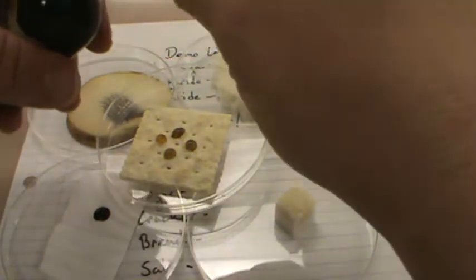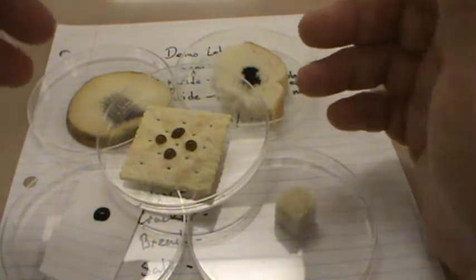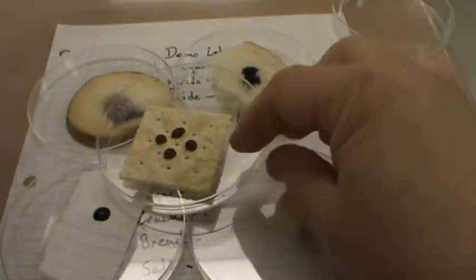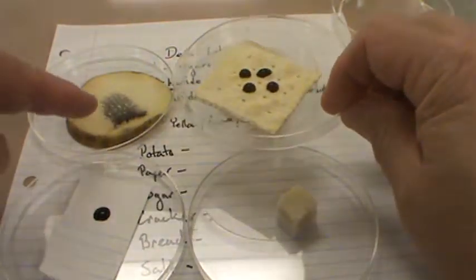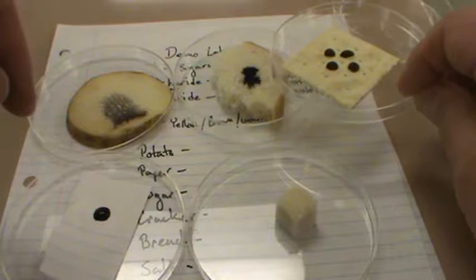Yep, that's changing colors. Now, just so you know, the whole fundamental purpose of this test is that when iodine comes in contact with a polysaccharide, it will change colors. It will change from whatever color it was, that golden yellow color, to a dark blue, brown, almost black color.